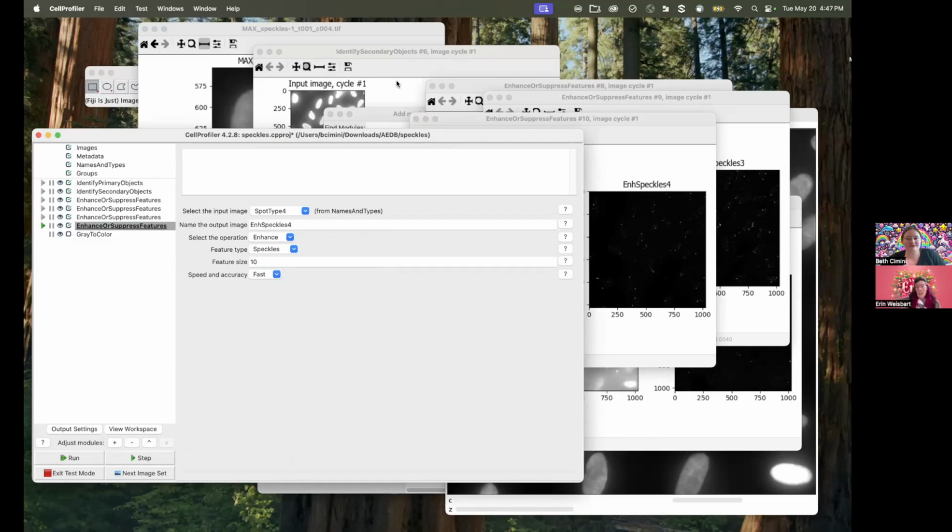Or maybe it's really only the bright honkin' 20 pixel wide foci, which are way fewer, that we actually want to find. So being able to talk to the biologist or get more information about the biology we actually want is an important thing when you're extracting actual information.